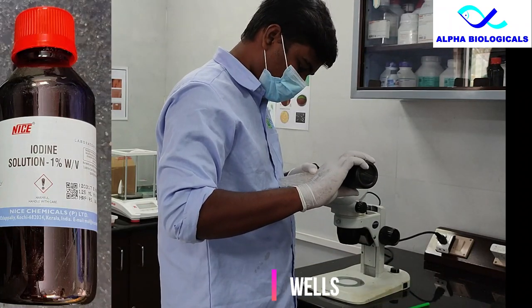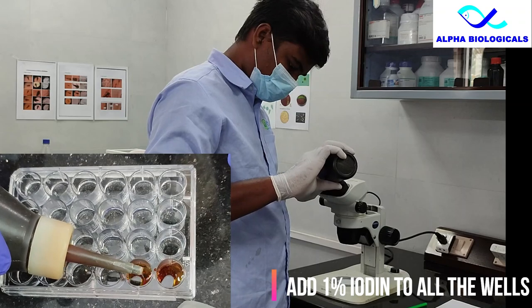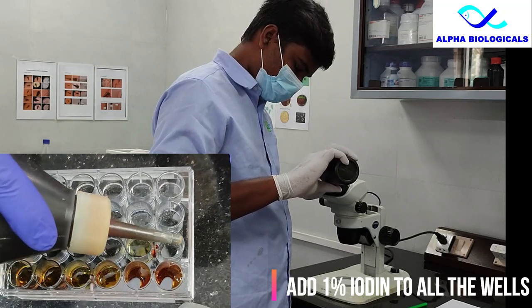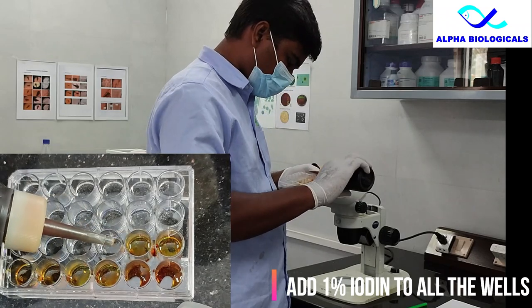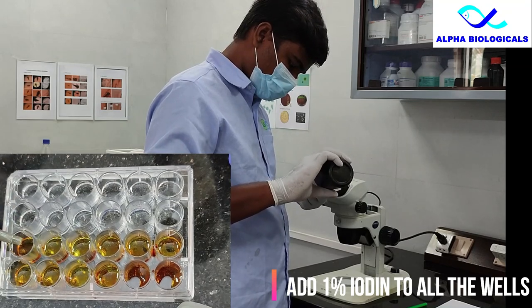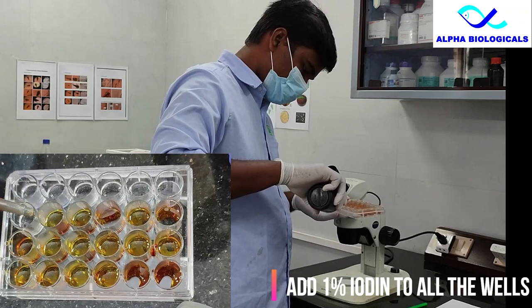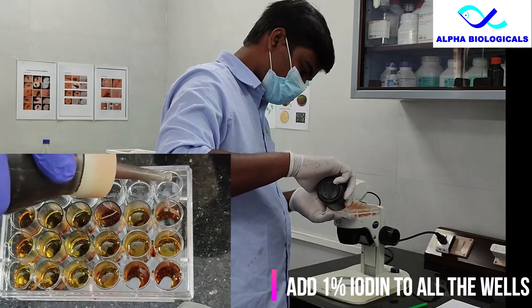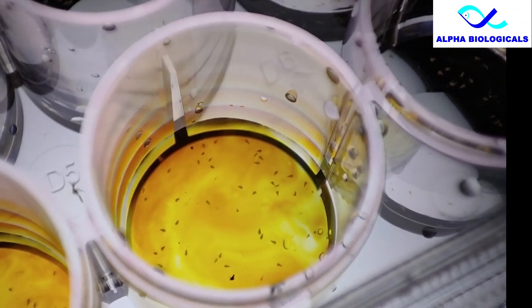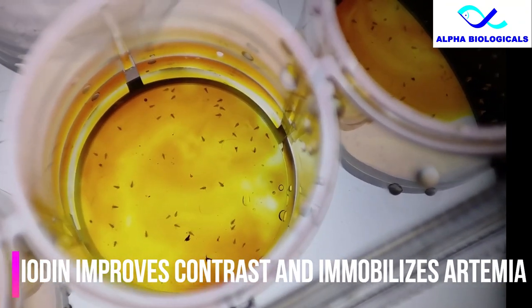To this add iodine — 1 or 2 drops of 1% iodine solution — to all the wells. It helps in immobilizing artemia, improves the contrast, and you can also differentiate instar 1 from instar 2. Instar 2 takes more color because its mouth is open. Adding iodine immobilizes the artemia so that it will be easy for us to count.